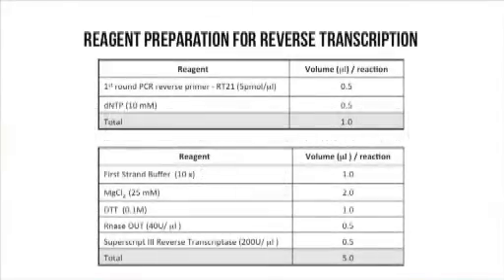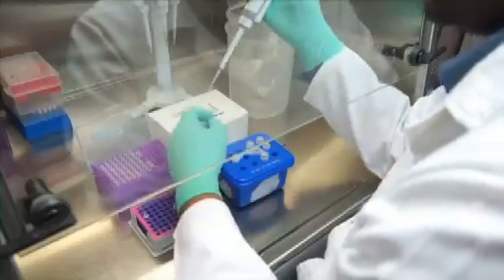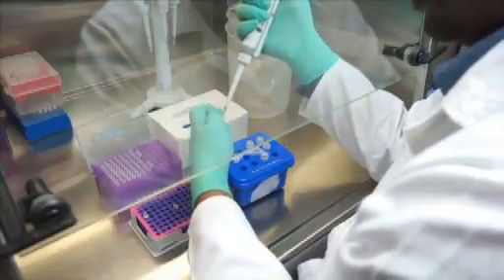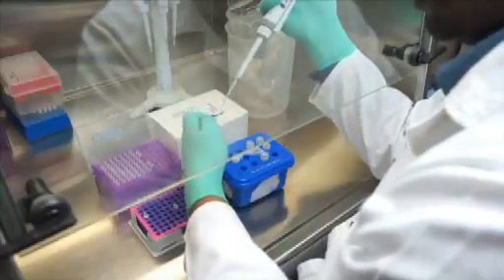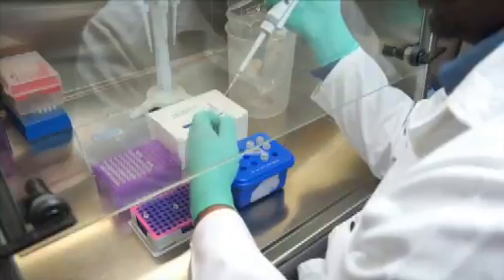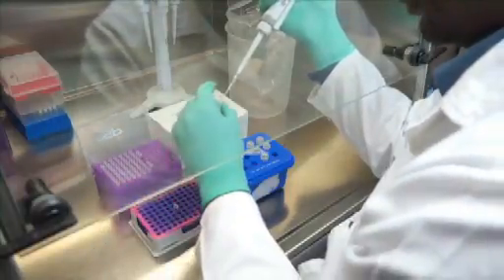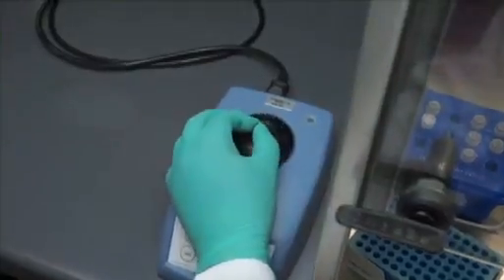Before starting, calculate the volumes of each of the reagents required for the number of samples being processed. It is recommended to always add a reagent control in addition to the extracted positive and negative controls. Prepare the DNTP primer mix by adding 0.5 microliters of the primer RT21 and 0.5 microliters of the DNTP mix to a clean sterile 200 microliter PCR tube, followed by briefly vortexing.